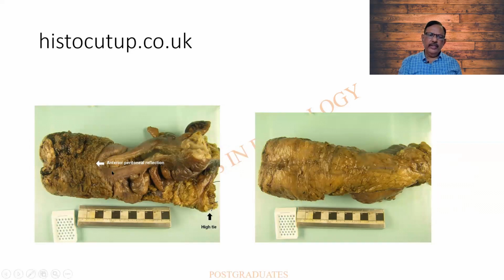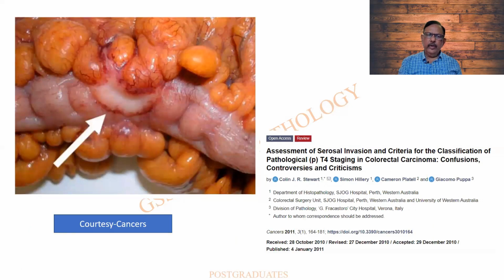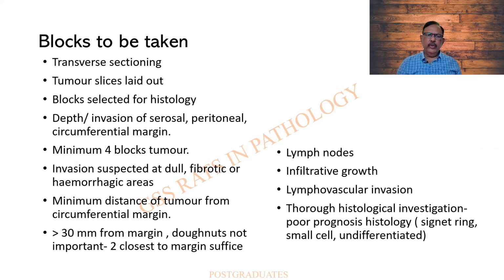So this is the inking and the painting that will be required, and then the external examination that is mandatory. This I had already shown you people about the serosal nodule. And when I do take the bits, it has to be a transverse sectioning, the tumor will have to be there, and then the depth of the tumor, to what extent. What the author says is, it is not the size of the tumor that matters, but the depth of the tumor. The prognosis will be depending on, one, the depth of the tumor.